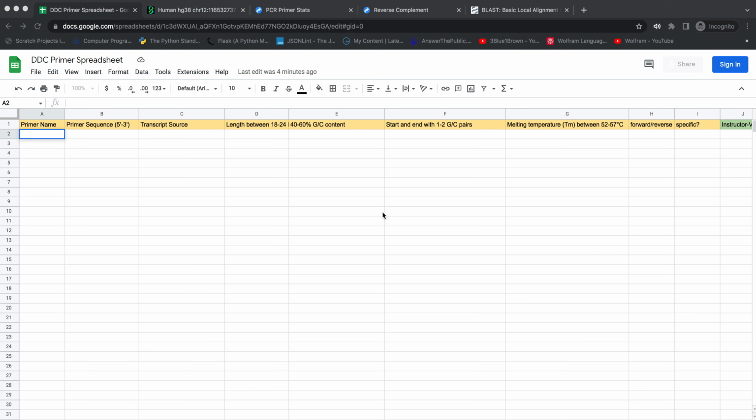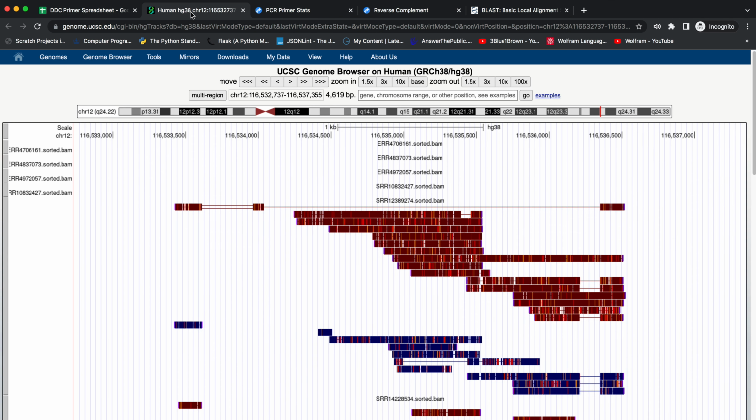Welcome! In this video, we'll be discussing primer design for your novel transcript variants. How do you know if a transcript variant is going to be novel or not?